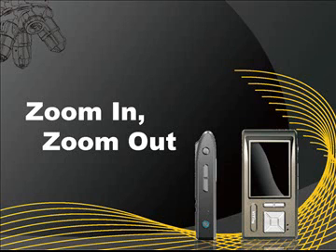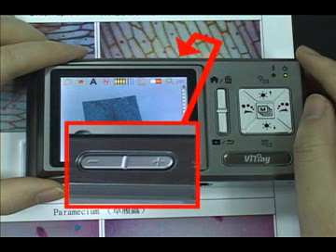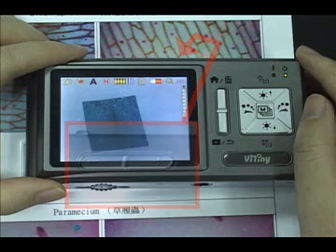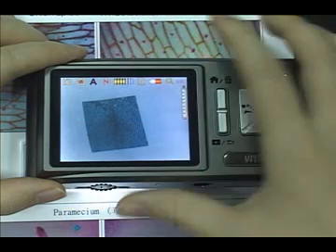Zoom In and Out: press the Zoom In and Zoom Out buttons to adjust the image size.